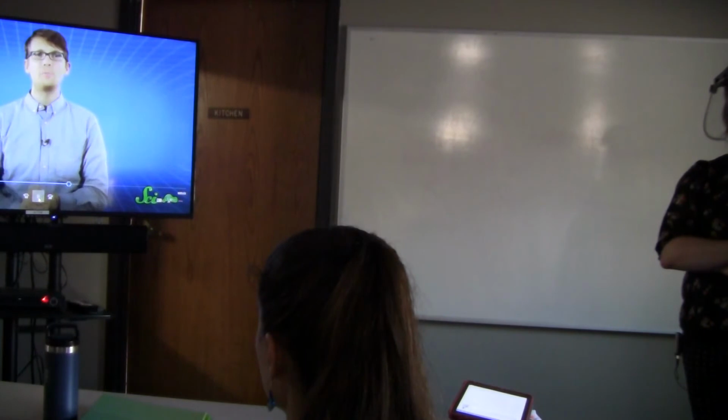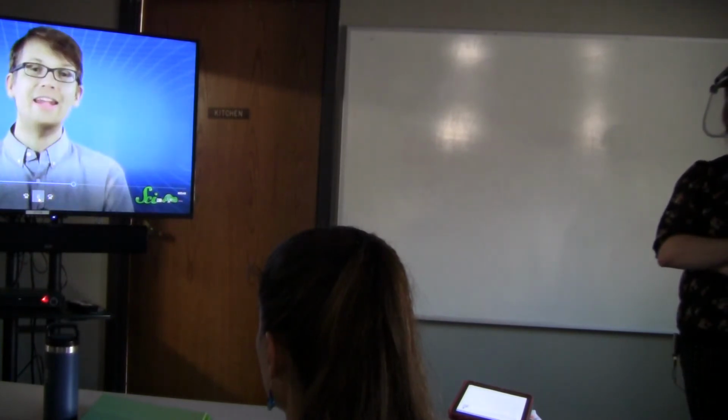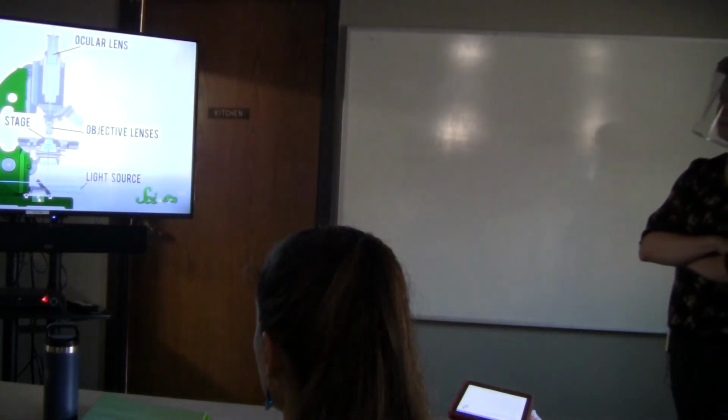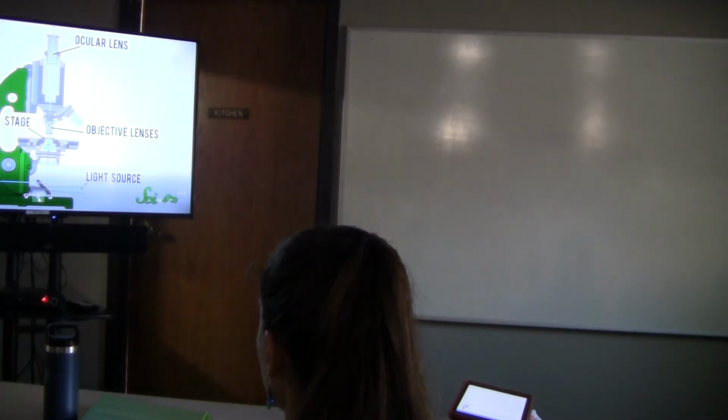Our understanding of the world around us would never be the same, and with each new generation, the microscope took on new modifications to make it sharper, more stable, and more powerful. By the late 1800s, we arrived at a version pretty similar to what you know today, with a stage for holding your specimen, a light source, usually underneath, followed by objective lenses that collect and focus the light coming through the specimen, and an ocular lens, or eyepiece, that magnifies the image.